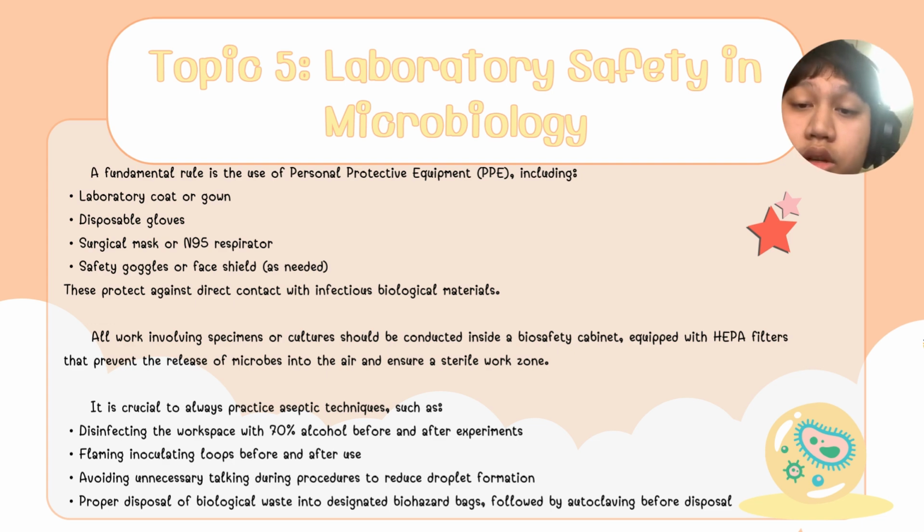zone. It is crucial to always practice aseptic techniques, such as disinfecting the workspace with 70% alcohol before and after experiments, flaming the inoculating loop before and after use, and avoiding unnecessary talking during the process to reduce contamination. Proper disposal of biological waste goes into designated biohazard bags, followed by autoclaving before disposal.